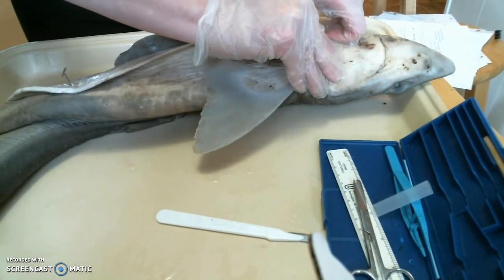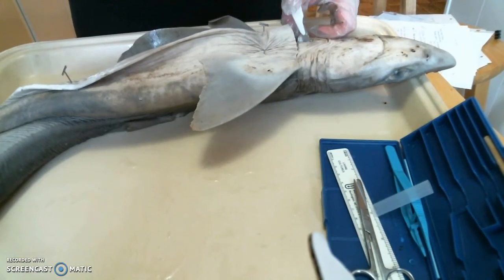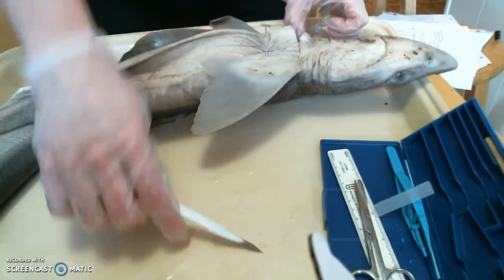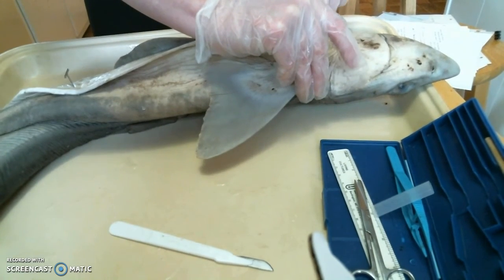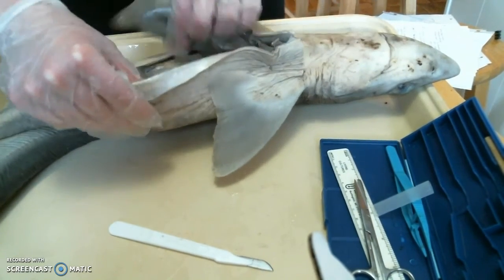Hard. I don't know. It almost is like bone up here. I don't know if... obviously it doesn't have bone, but it's thicker cartilage. I guess I don't know that I can cut that. And definitely I don't think that a student would be able to cut through that. It's something really hard. Yeah, there's a really hard piece right here. So maybe we'll have to cut around it later when we get to that part.